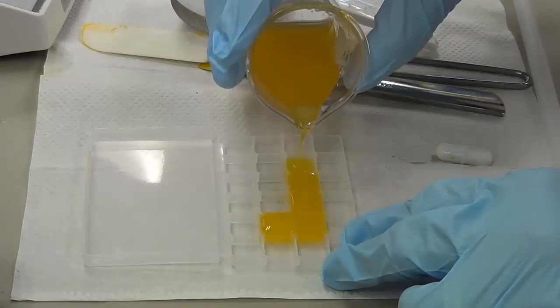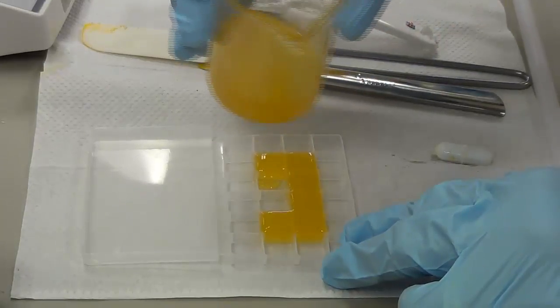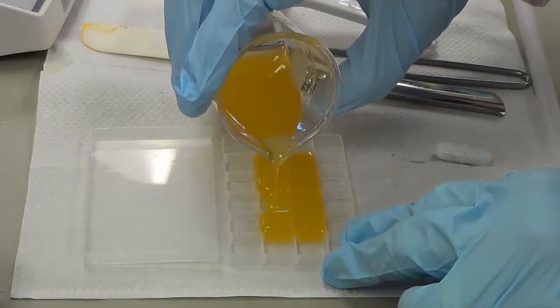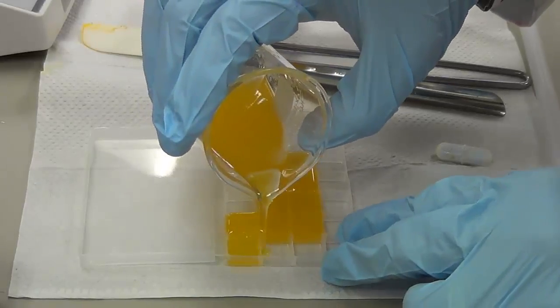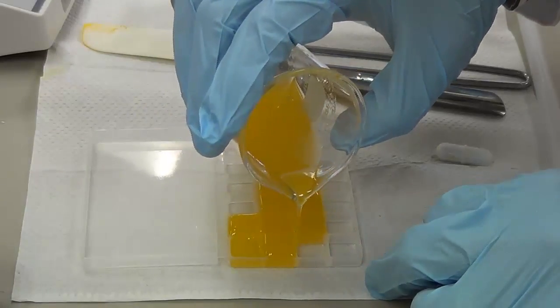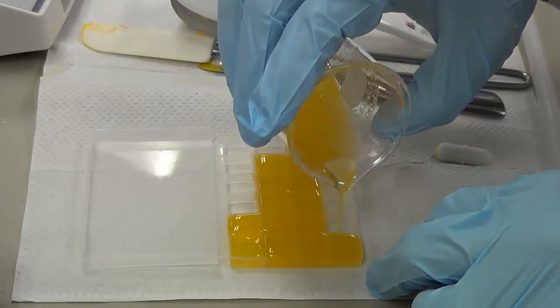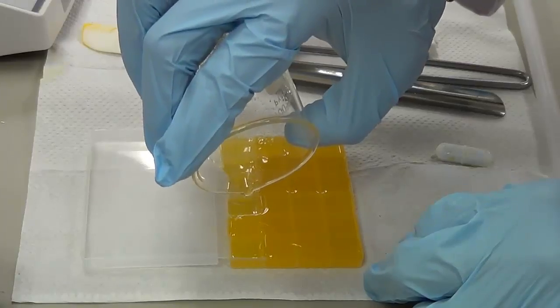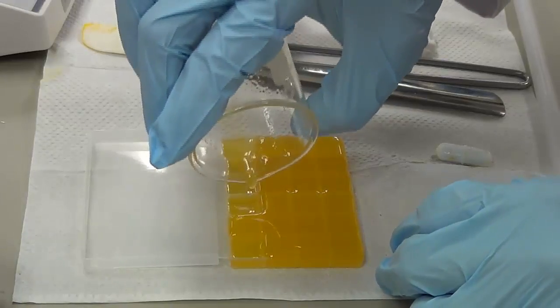You can fill up this troche mold in whatever way you want, but usually I fill up the central ones first and then move to the peripheral ones. Fill it and top it off completely, so that once the mold contracts, it's going to flatten.